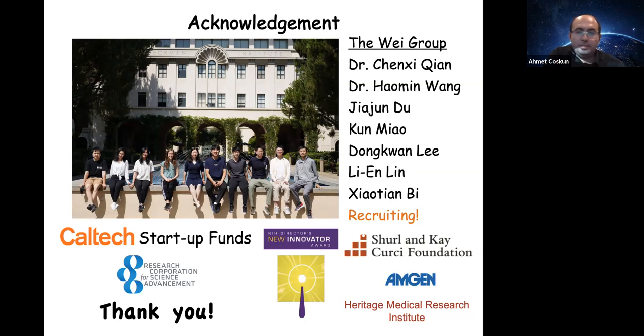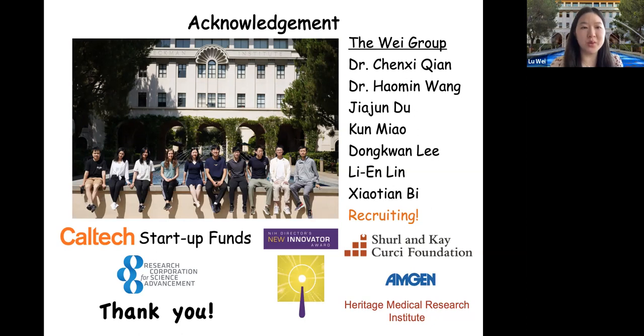Cool. And so that means the frozen section works, right? The frozen section, and if you lightly fix it with PFA, that should be fine. Yes, that would work very well. We have demonstrated this with Jim. Cool.